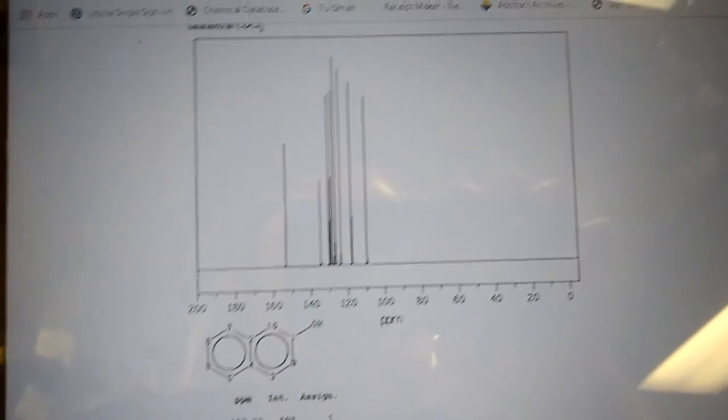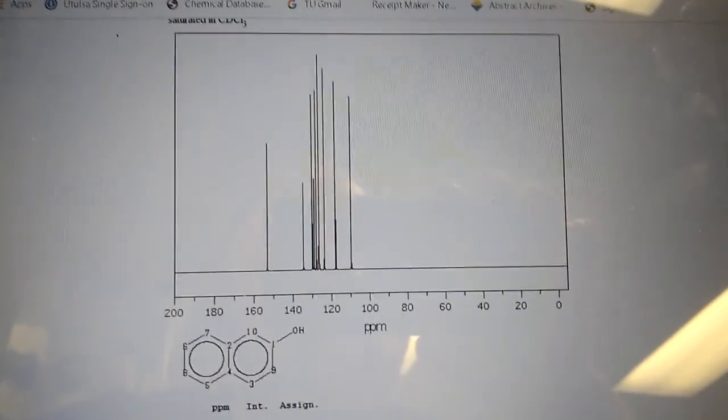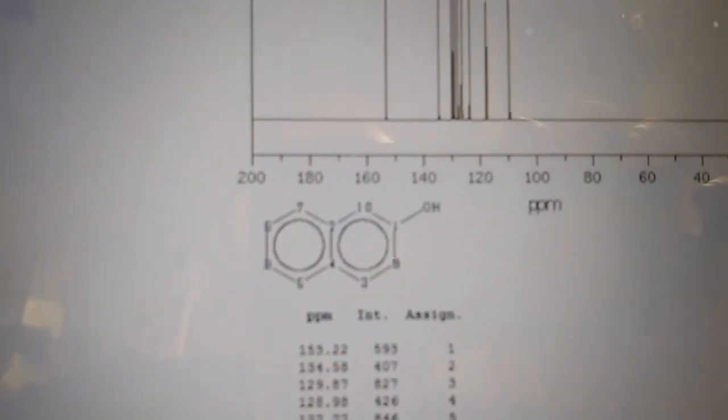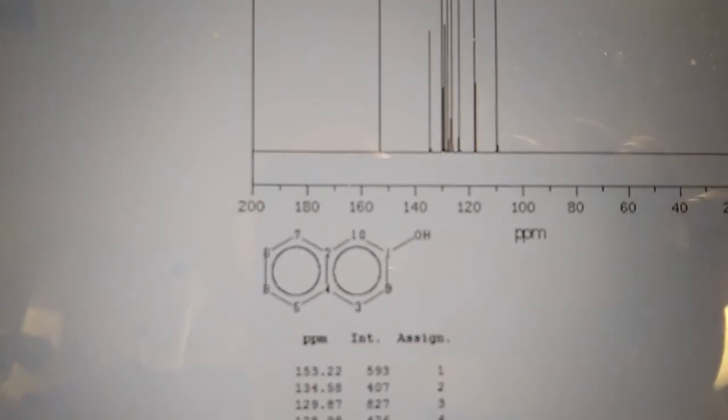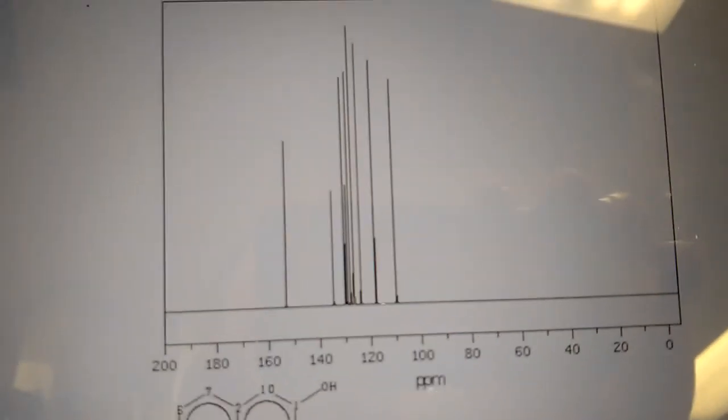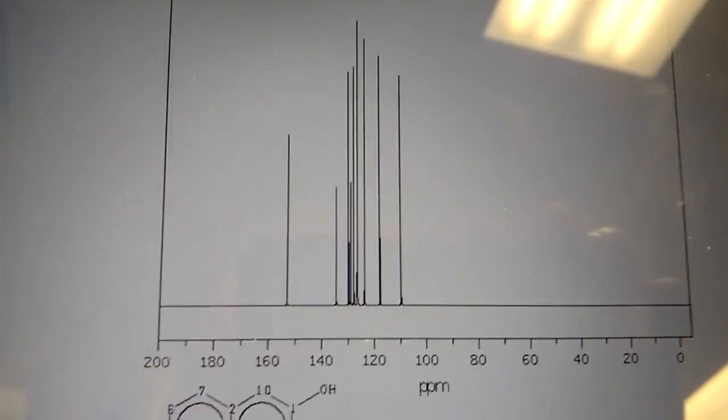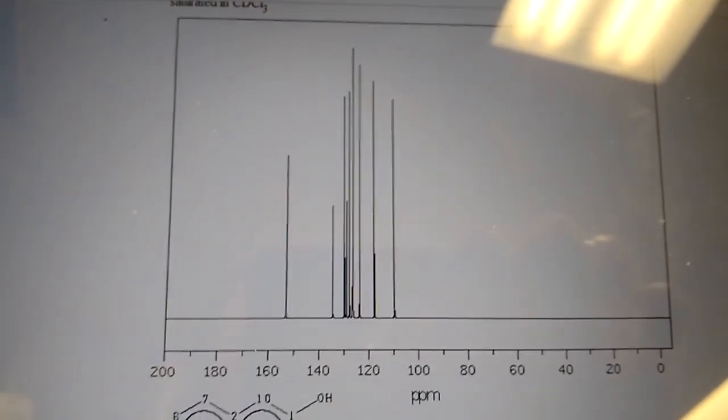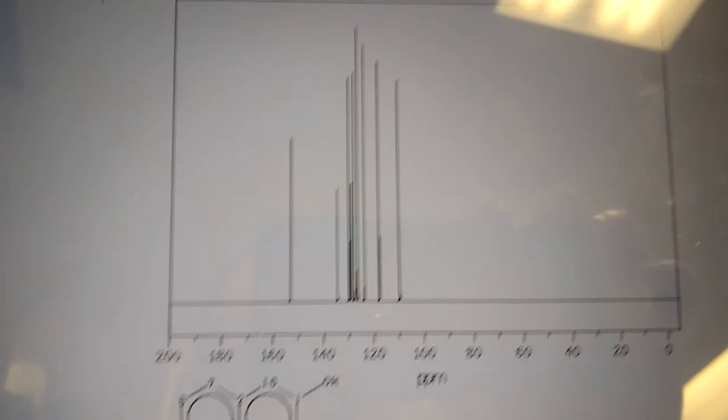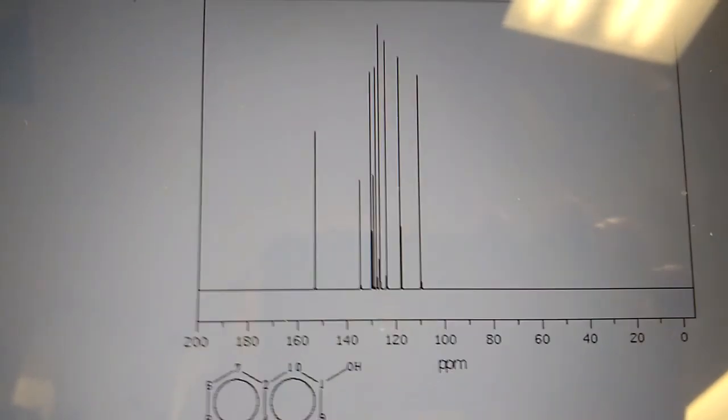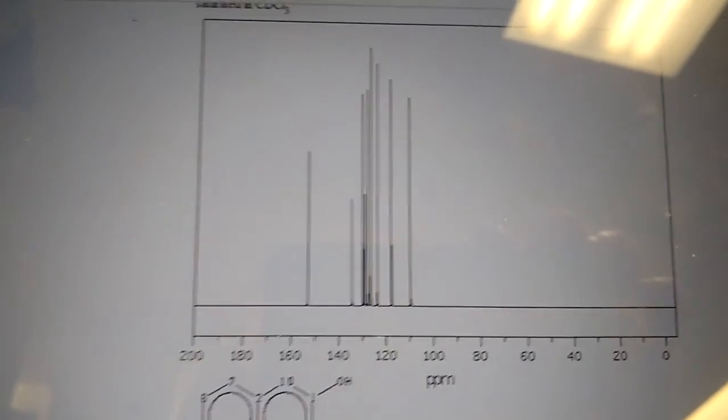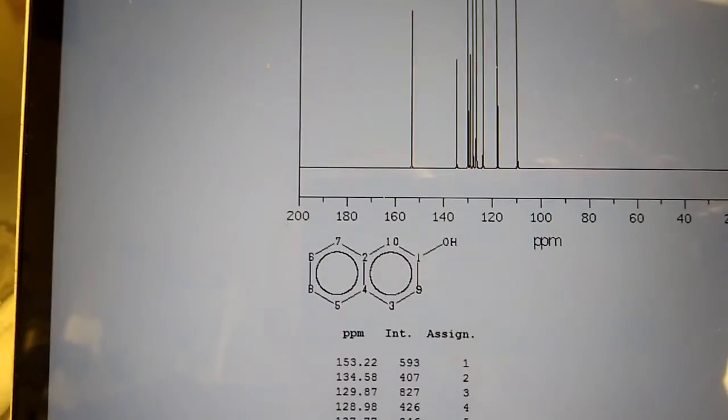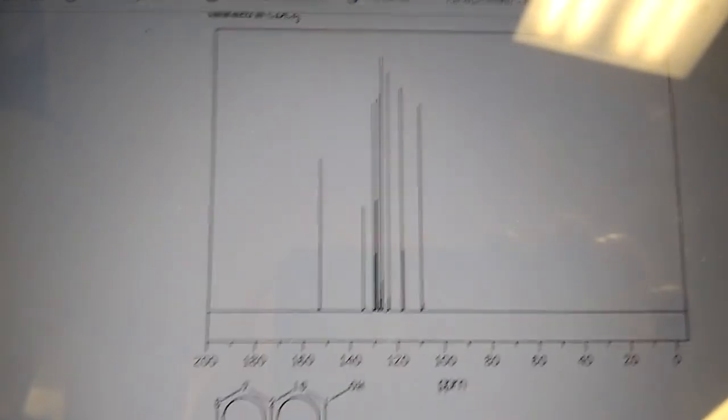For carbon NMR, it can be a lot simpler. If you look at your structure, you've got ten total carbons and they are all aromatics. So when I say simpler, I mean that for the sake of this course, you won't see any splitting in a carbon NMR, and you also, the integrations are, for us, they're meaningless. So the height of the signal doesn't tell you anything.